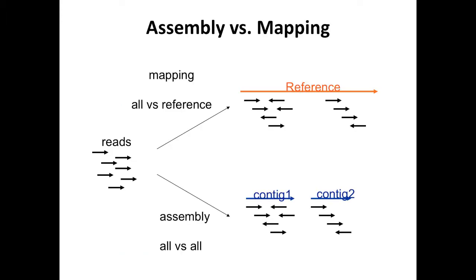So to do the alignment, you need to have a reference. So it's really when you have your FASTQ, you have two choices. Either you do the alignment, but to do that, you need to have a good reference sequence. If you don't have one, you will need to do assembly. You will see that tomorrow afternoon with Jared, who will come and present. So I will not give you so much detail on that.